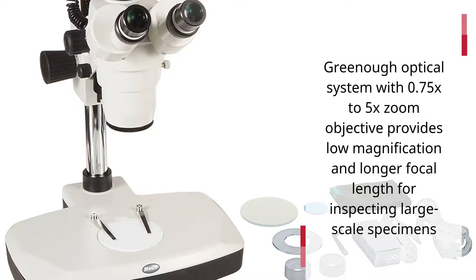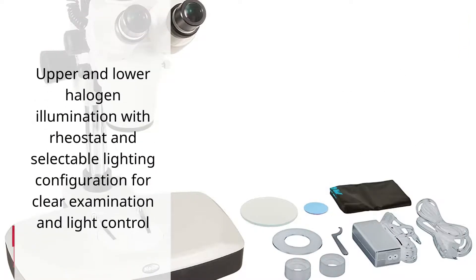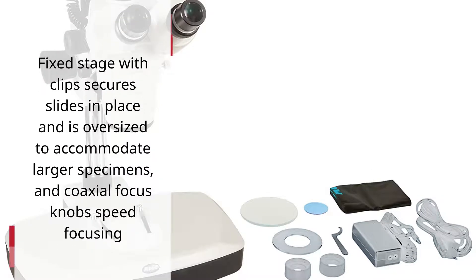The Greenough Optical System with 0.75x to 5x zoom objective provides low magnification and longer focal length for inspecting large-scale specimens. Upper and lower halogen illumination with rheostat and selectable lighting configuration allows for clear examination and light control. The fixed stage with clips secures slides in place, is oversized to accommodate larger specimens, and coaxial focus knobs speed focusing.